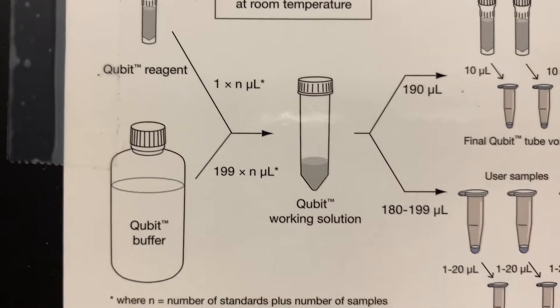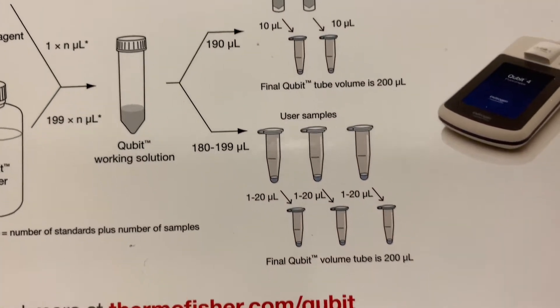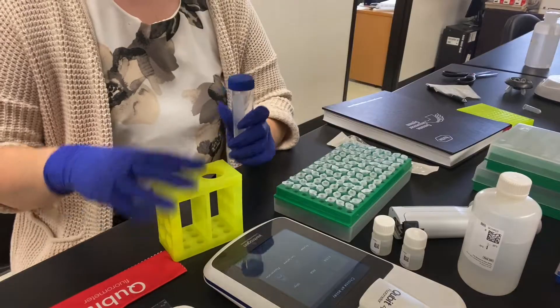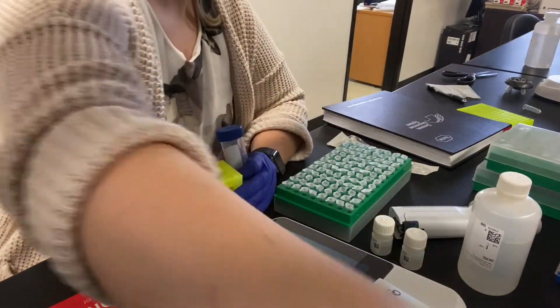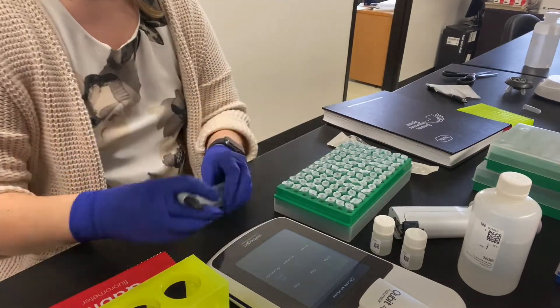Next we'll calculate the appropriate volume of working solution by using a 1 to 200 ratio of reagent to buffer, and that way we know the appropriate size tube to select. I always label the tube with the type of kit that I'm using as well as the date.